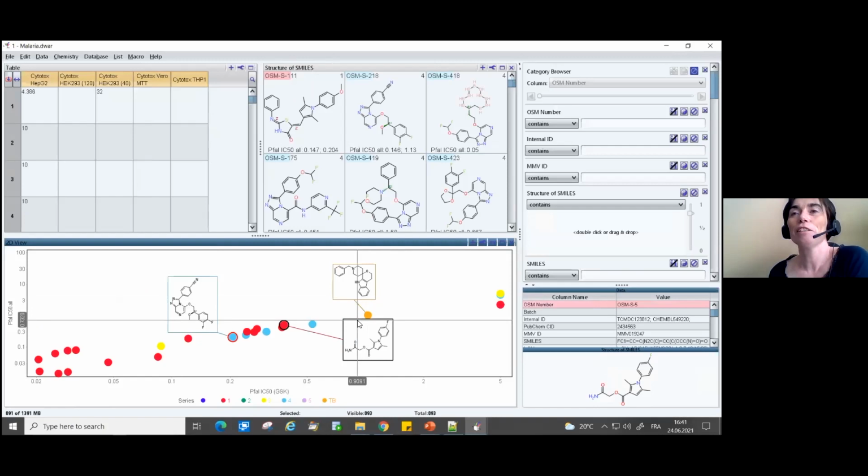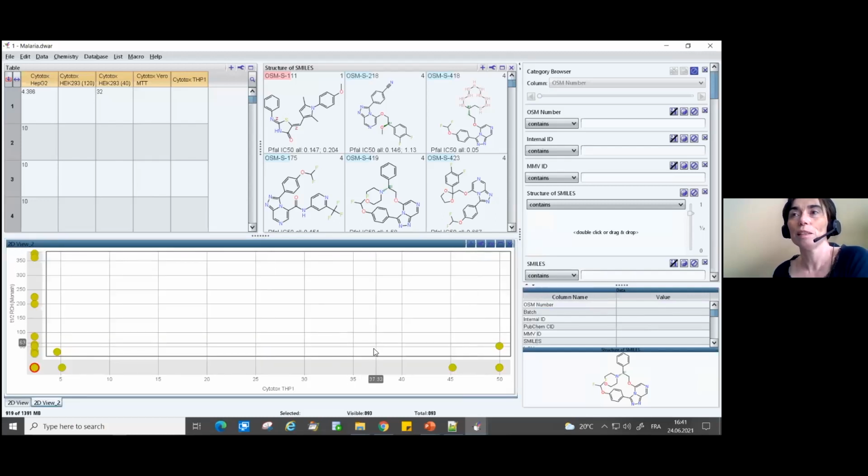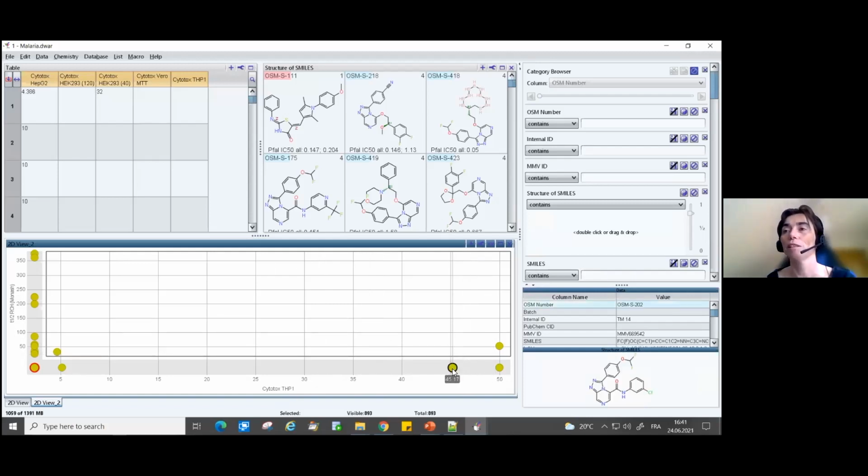And I wanted to show you how to create such views, actually. So I will start from scratch. When you create a new 2D view, it looks like that. So completely, I mean, it's always the same default color. It's rose or greenish.